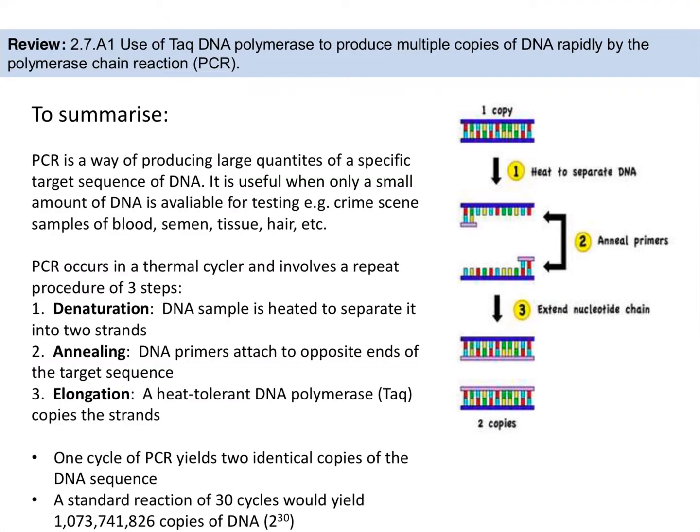And to summarize the process of PCR, again, we take the strand of DNA that we want to copy and we heat it so that it will denature. That is the first phase of our PCR step, denaturation, so that all the hydrogen bonds between the double DNA strands will separate.